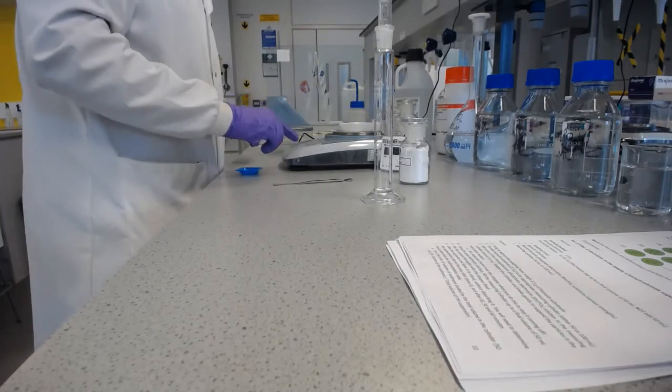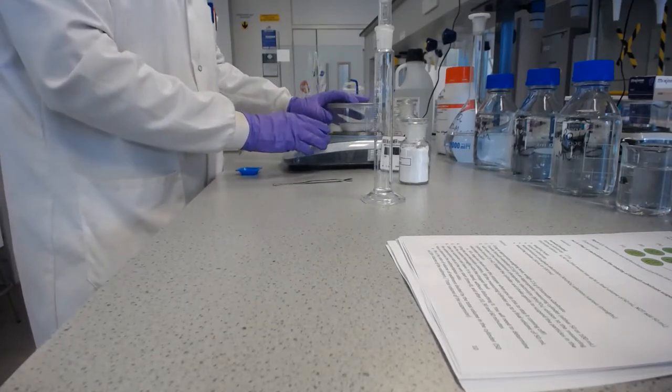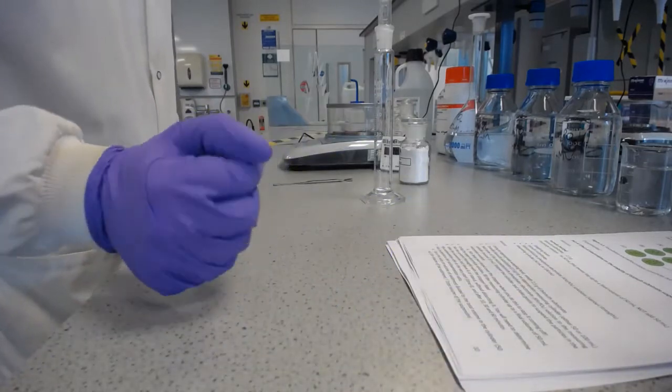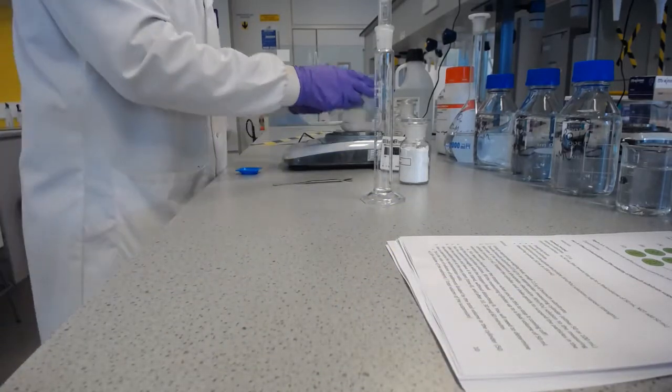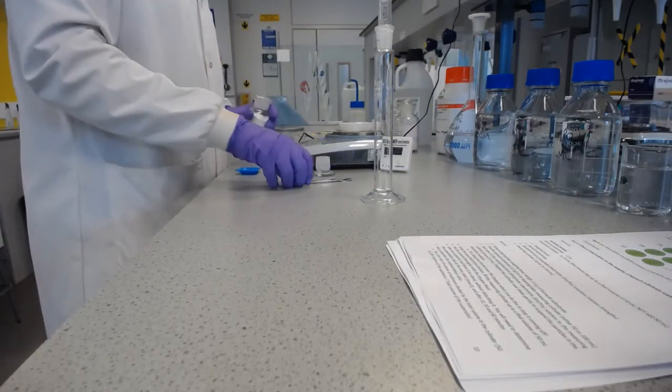So I'm going to use a weighing boat for this. I'm going to zero my balance for that. And it says to weigh 2.5 grams of bismuth. Okay, that's fine. So I'll take that off, open up bismuth.